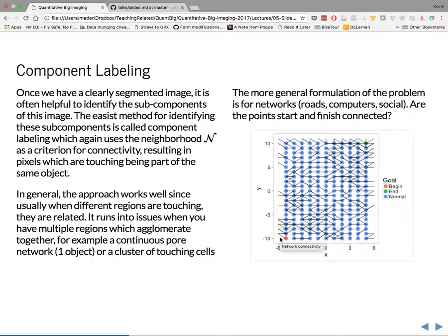Student: Do you decide with respect to the color of the pixel if they are from the same object or not? No. Then how do you decide? If they are connected. With the color of the pixel, so like the intensity. Yeah, with the intensity, we make a segmentation, and we use that usually as a very important feature for making the segmentation.